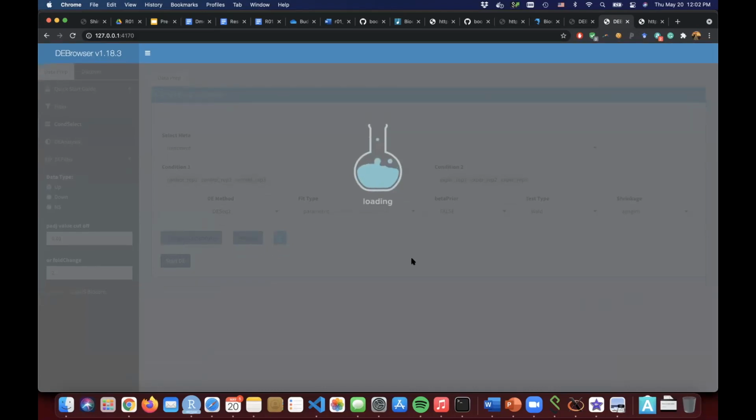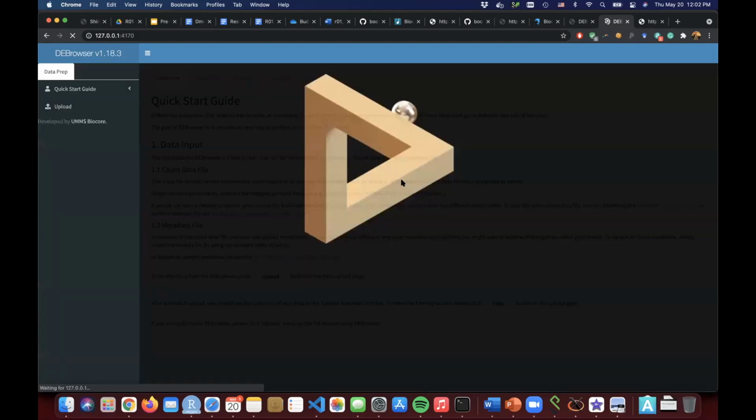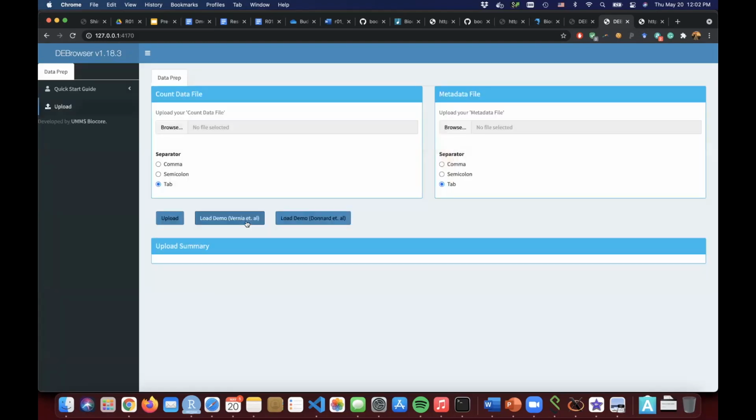Something, I got an error for a reason. I don't know what happened. But if you get an error, refresh it and do the same thing again. And this gray screen happens when you are using this version and the connection is gone. By the way, we're done today, I guess.